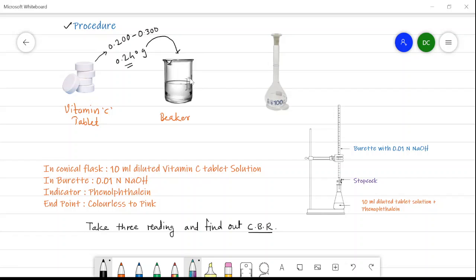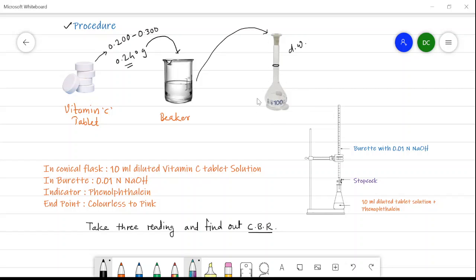The content in the beaker is transferred to the 100 ml dilution flask. After transferring, the whole solution is diluted up to the 100 ml mark using distilled water. This whole 100 ml solution is then used for the titration purpose.